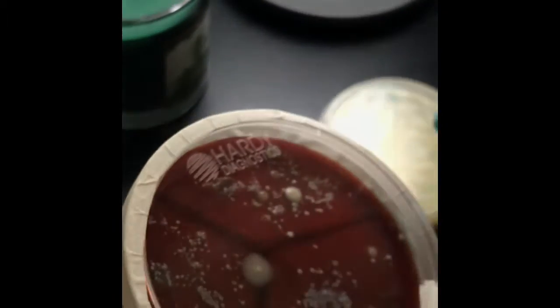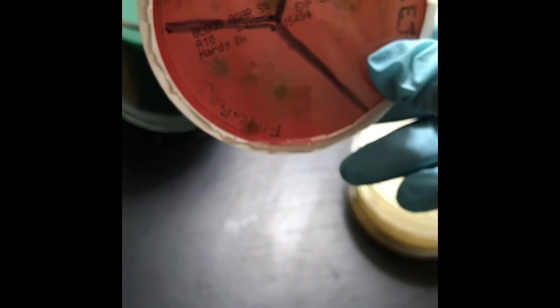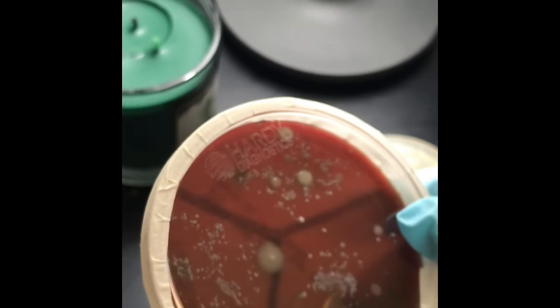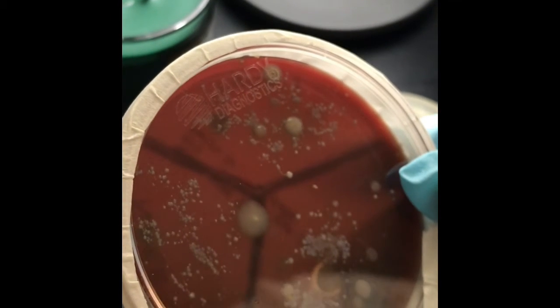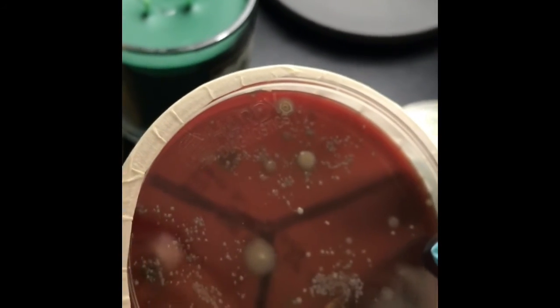Now there are more colonies over here at the top, but those are not making any green color, because you cannot see from the back. So they are showing gamma hemolysis. That means they are growing over there, but they are not breaking down the blood cells.